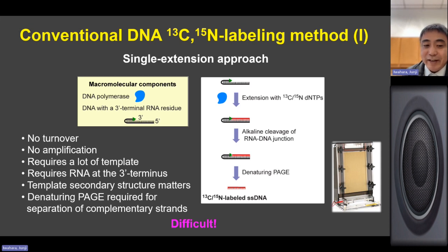And denaturing PAGE is quite painful, and usually the yield is not so great anyway. Basically, this method is not really simple. It is labor intensive, and some special skills are required. It's quite difficult.